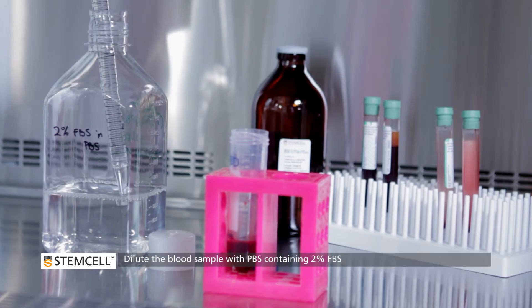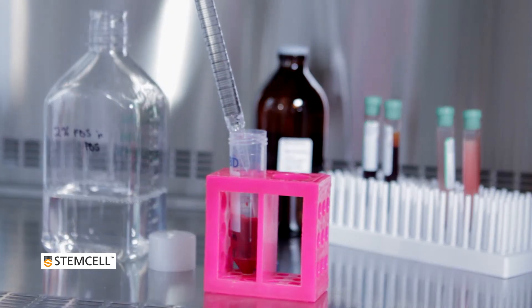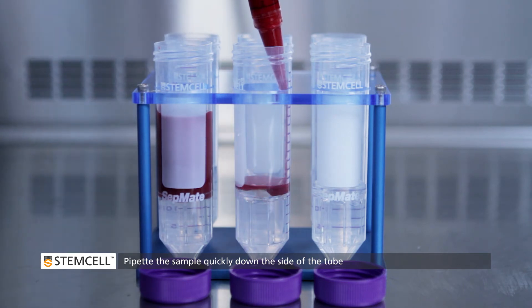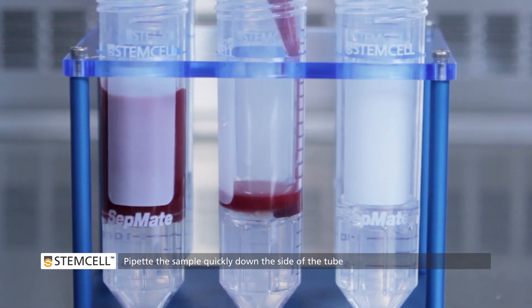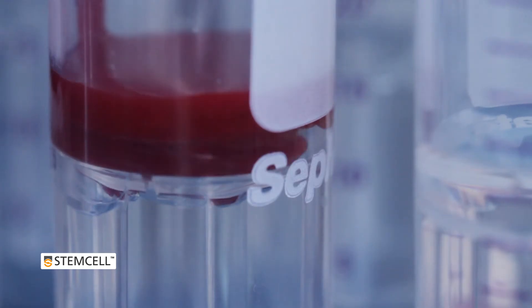Next, dilute the blood sample with an equal volume of PBS containing 2% FBS. Keeping the SEPMATE tube in the upright position, pipette the sample quickly down the side of the tube. SEPMATE keeps the sample separated from the Density Gradient Medium.